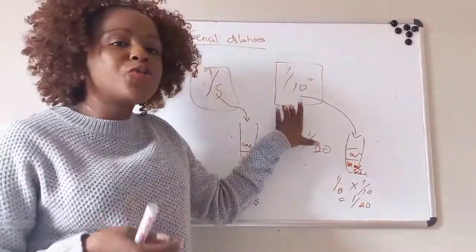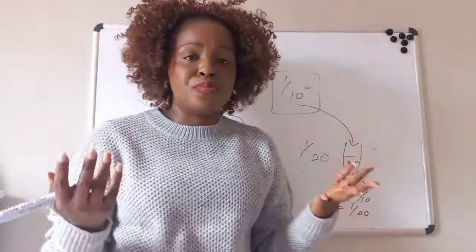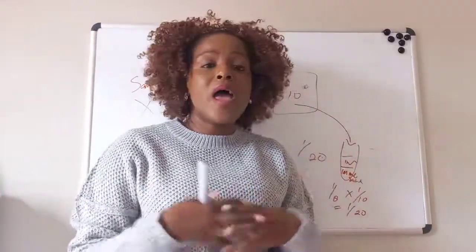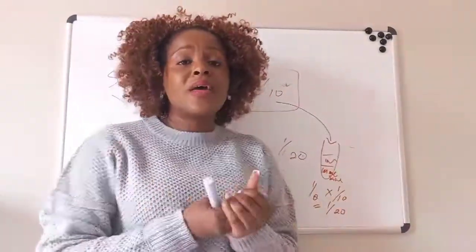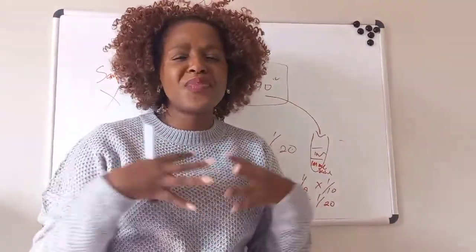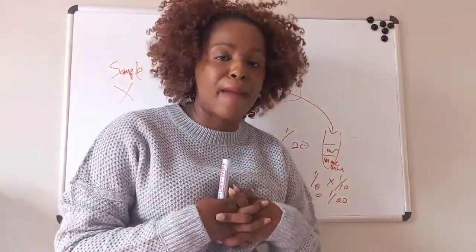So this is how you can use serial dilutions practically to make sure that they work for you. Basically, that's what I wanted to share with you, and hopefully it makes sense and you'll be able to incorporate this into your work if the SOP of your laboratory allows it. It would be a nice thing to know and to do, so that we are proactive and we are able to beat the turnaround time.